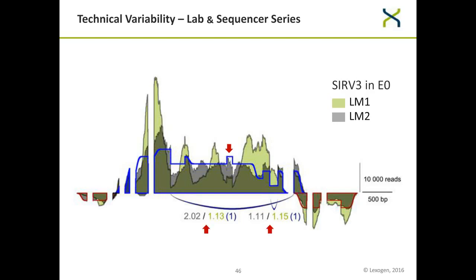It's also nicely seen that you see the coverage contribution of one transcript here. So that is one exon contributed by only one variant. And you also see that in terms of junction coverage, you sometimes have a high agreement and sometimes you don't. So already here, although it's the same RNA but sequenced at different locations, there's a high divergence.